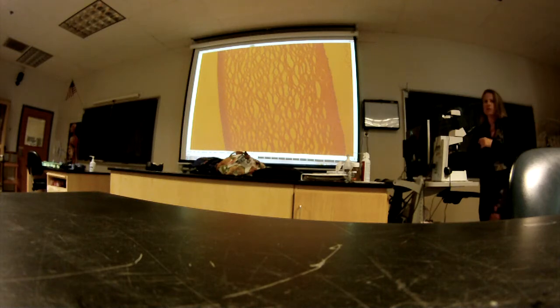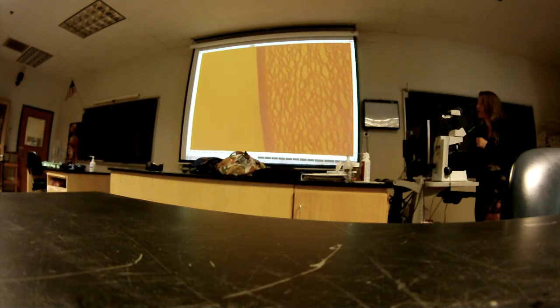It's a squamous layer, non-keratinized. Yeah, it's the conjunctiva, and it's the ocular one. Remember I added that one to your lab.